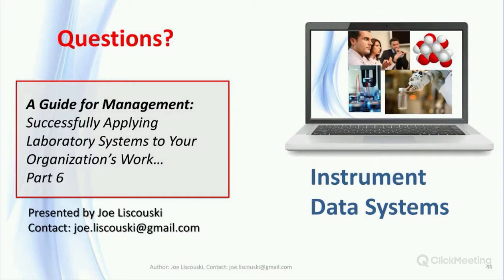One problem is if you wind up with things too tightly integrated, when one thing breaks, everything breaks. So you have to separate things to build in some fault tolerance. Imagine you're running a laboratory with a lot of instrumentation. Everything is resolved into one computer system, and somebody decides to do an upgrade on that computer system, and it doesn't work right. And that system is down, which means the entire lab is down. So you really need to do a lot of planning about that sort of thing. LIMS have their role, but complex instrument data is not a good place for them.